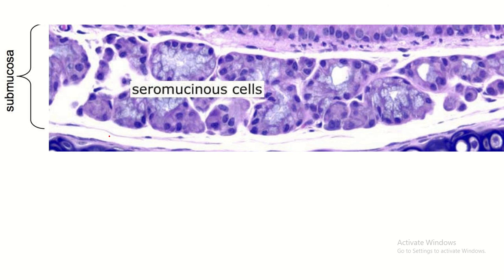The submucosa is formed by dense irregular connective tissue. 'Dense' means it contains more extracellular matrix but fewer cells. 'Irregular' means the extracellular matrix — including collagen fibers and elastic fibers — are arranged irregularly, and the cells are also arranged irregularly. This submucosa contains seromucous glands.